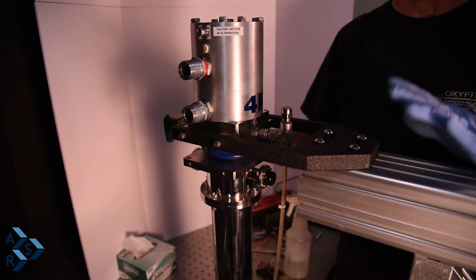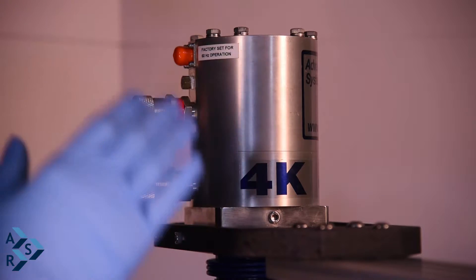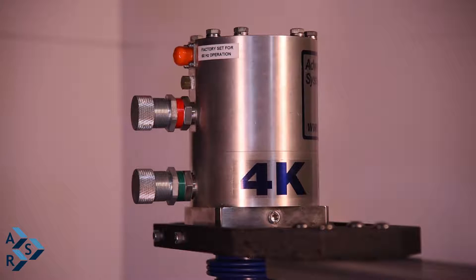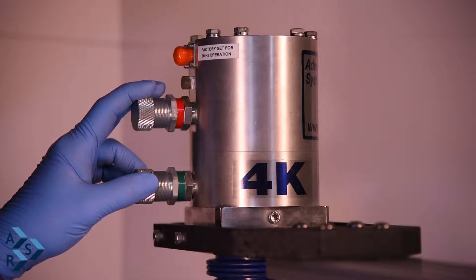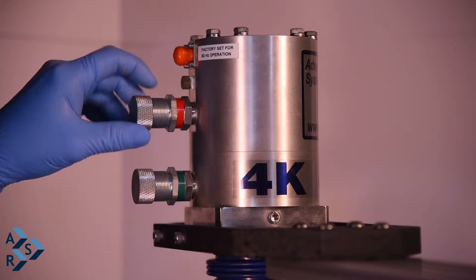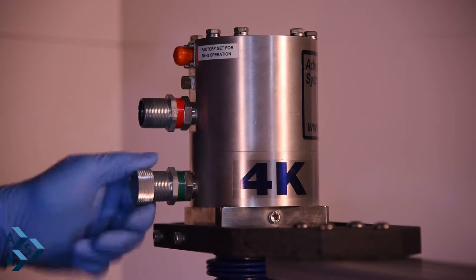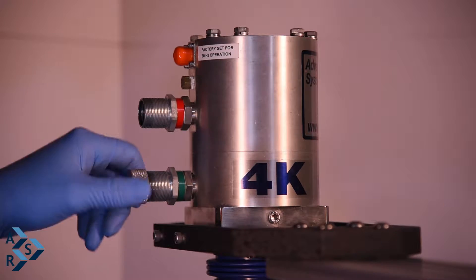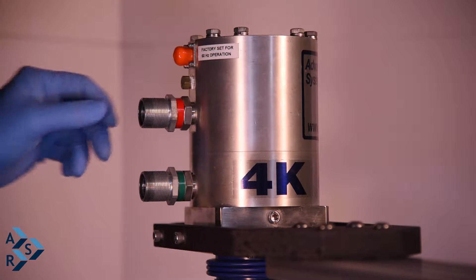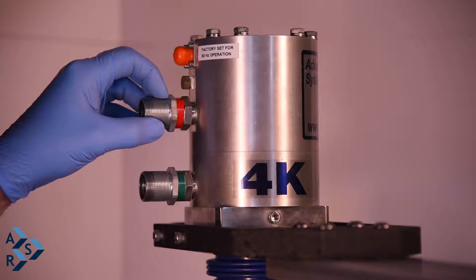Now we have the stand with forks tied in and the interface bolted down to the air table. Let's go through hooking up the supply and return on the cryostat and the run cord to get ready for operation. All connections come with a dust cap that you need to remove. Then inspect the air clips to make sure you have this small face seal on there, because if that is off and you put your connection on from the hose, it's going to end up leaking.